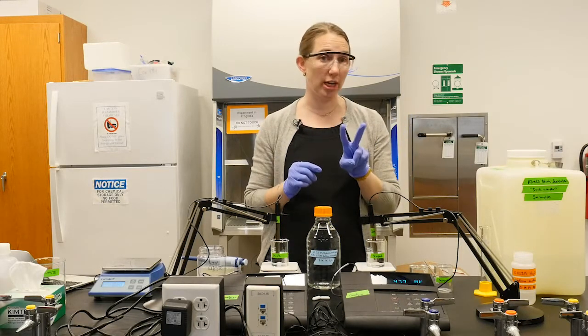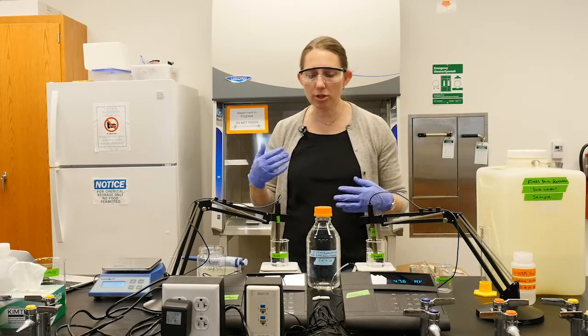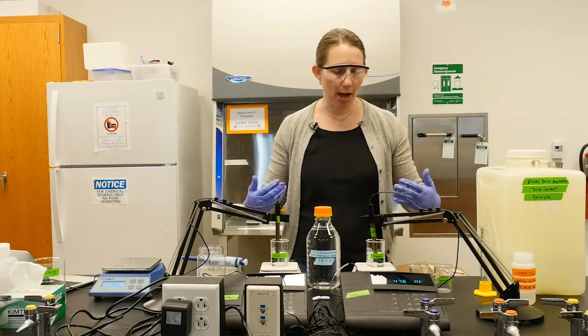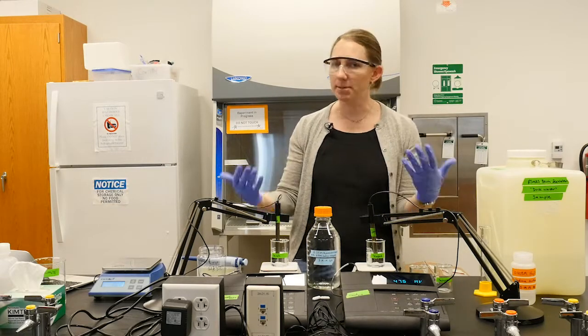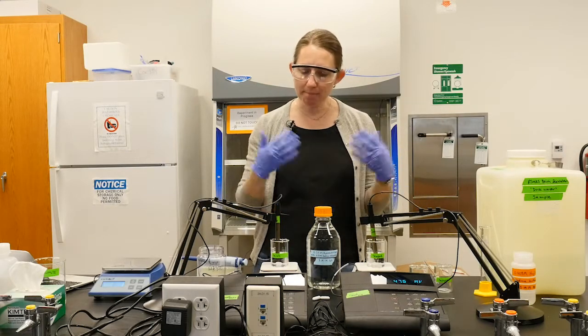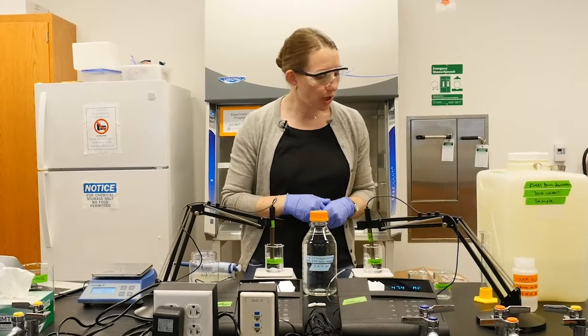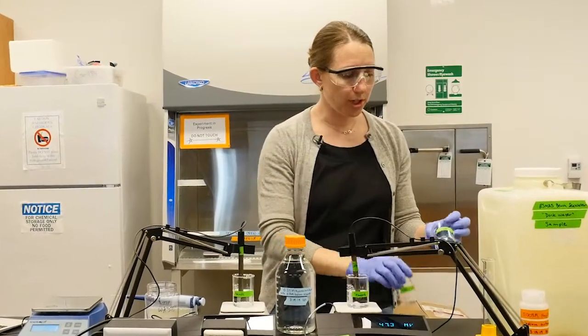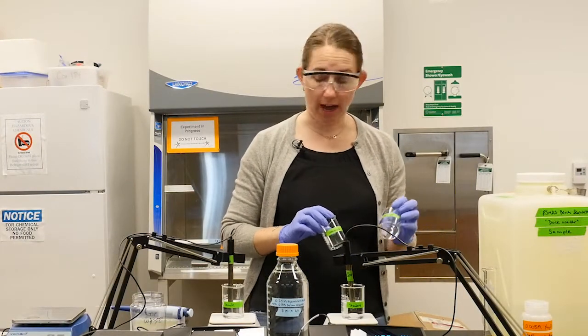So we're going to be doing two titrations. If you're doing this by yourself in the lab or with your group, usually you would run these sequentially, but we can run them in parallel here, since it's the same setup for both. So we're going to get our standard and our sample prepared, and then run these two titrations in parallel. The first thing is, as we're doing this titration, you need to know how much seawater you have in each vial.